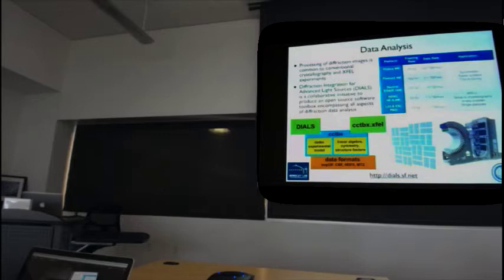And this is maybe a good thing because there's an opportunity to develop software that really deals with both sides of this. So just to mention one project that I'm aware of, the DIALS project, this collaboration between folks in the UK and here in Berkeley, I think Sam's here, are really trying to build the next generation of data processing software that thinks about the commonality between all of these things.